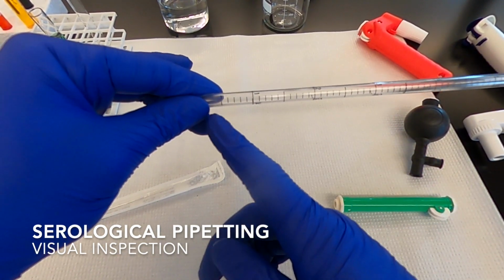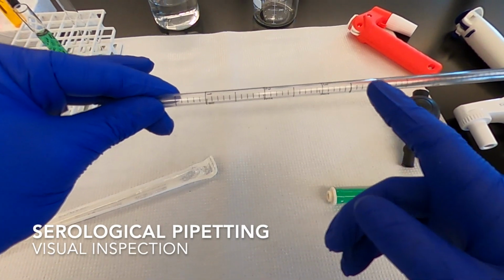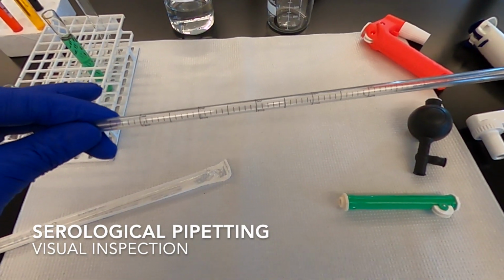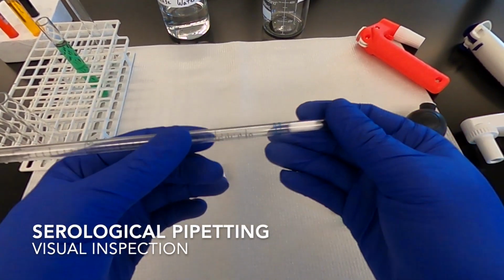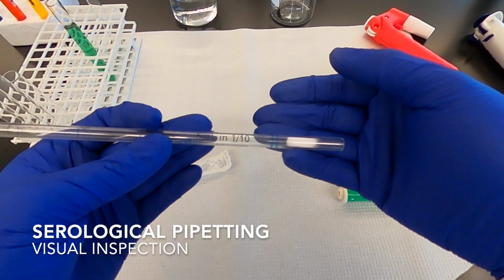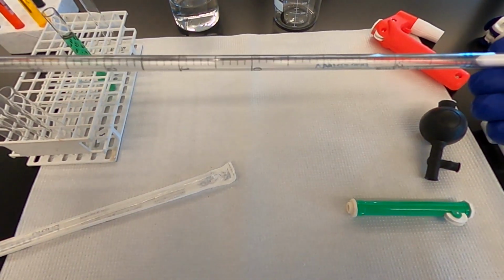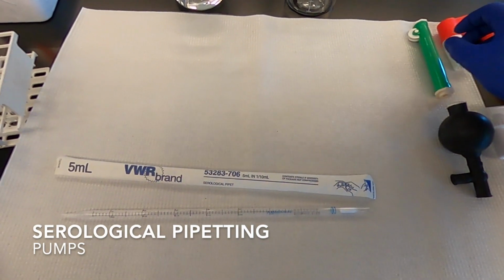Also, notice that the graduations extend beyond 5 milliliters. So 1, 2, 3, 4, 5, 6, 7, and a half. So this 5 milliliter pipette can actually measure 7.5 milliliters. Lastly, notice that on this pipette there's a white cotton swab at the tip. This is to help keep the pipette sterile when you use tissue culture reagents, but it doesn't really matter for our purposes.